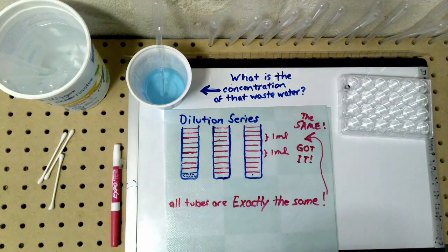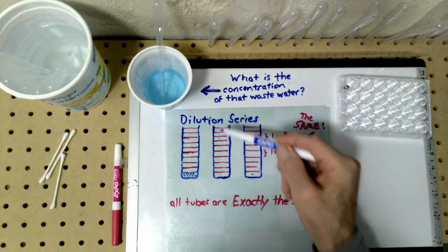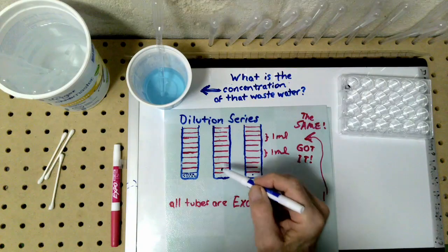If I go times 10, that means that you're spreading 10 times further apart. Let's imagine putting those 10 dots over here and then adding water. How much water would you add? The tendency for a lot of people is to say, add 10 drops of water, speaking in terms of drops here.